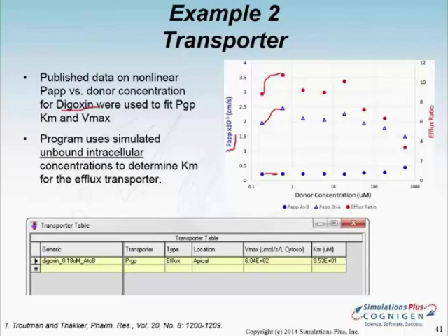If that's the case, you could use MembranePlus to perhaps predict the permeability part for the API alone, and then calculate what may be the rate of release from the nanoparticles. Thank you, Viera.